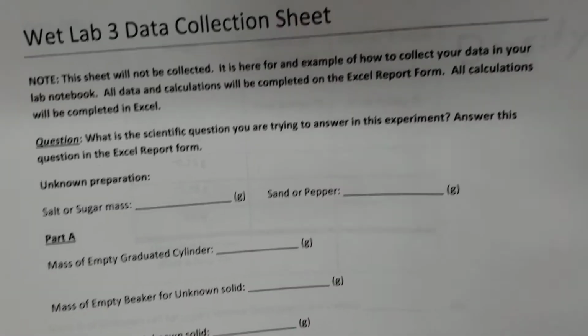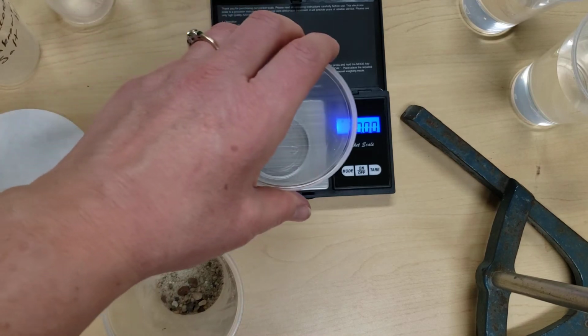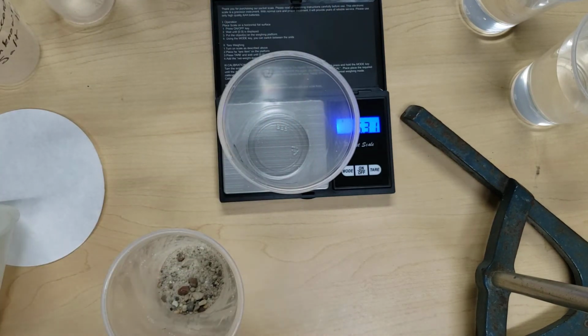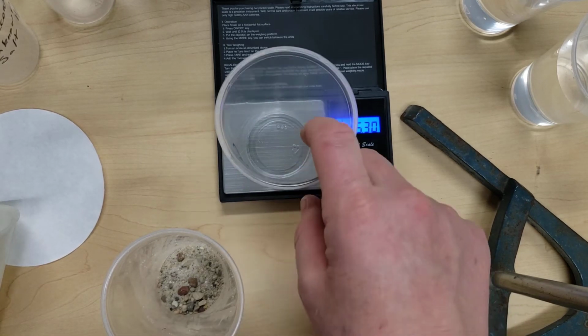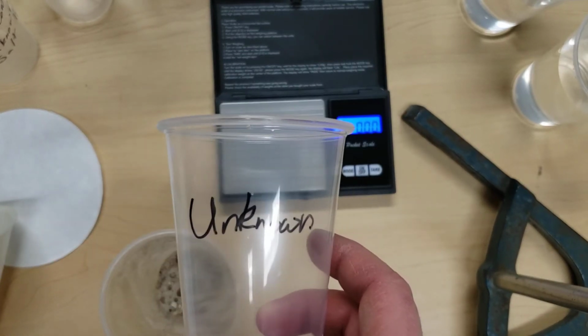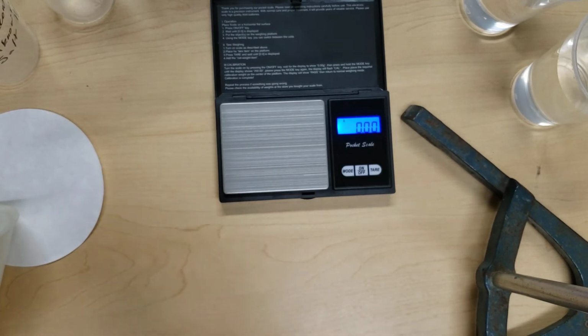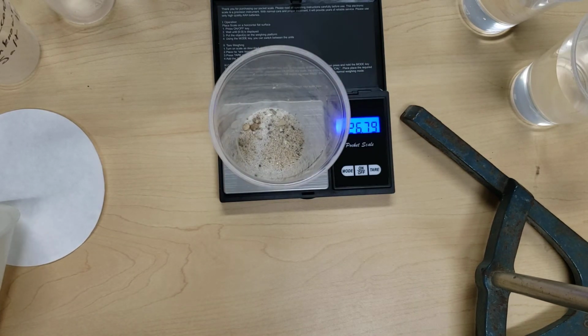And we are going to take the mass of an empty container and record the mass of that container. I do find it helpful to label all of the containers so we know what they contain. So we're going to place all of the unknown, that mixed unknown that you made, if you can transfer it into that container and then record the mass of the mixture of salt and sand.